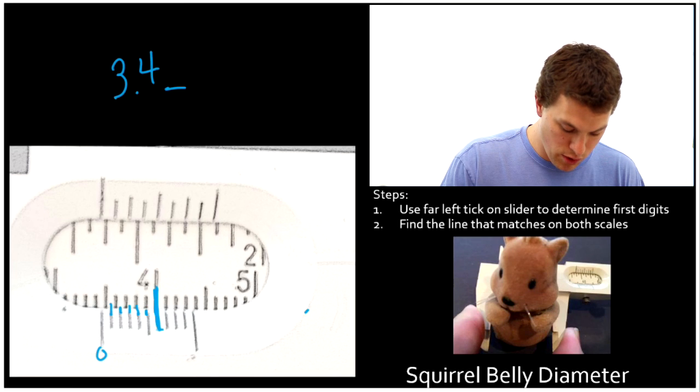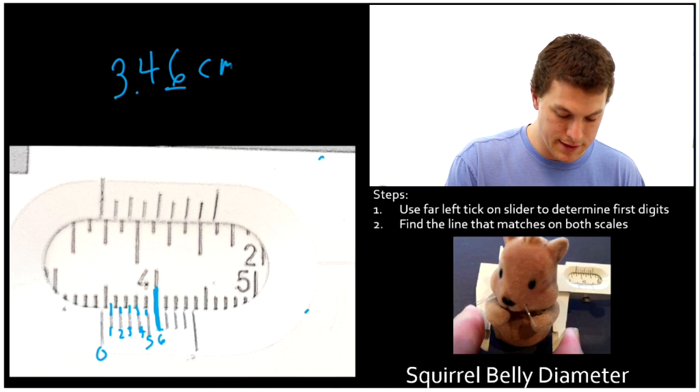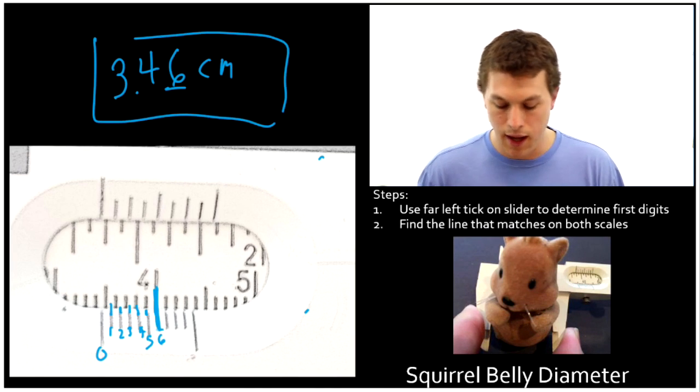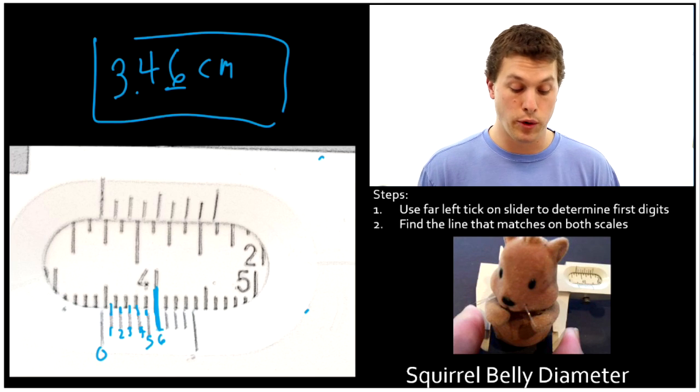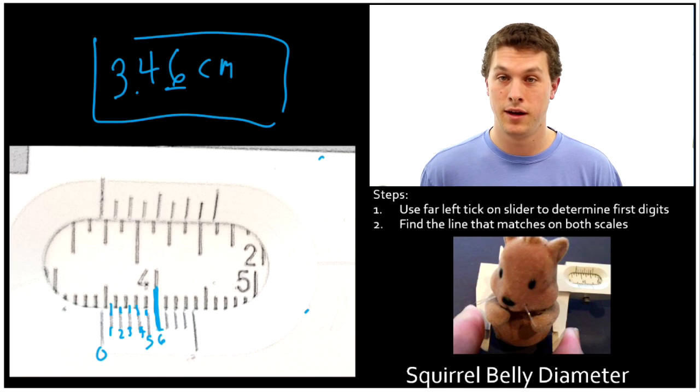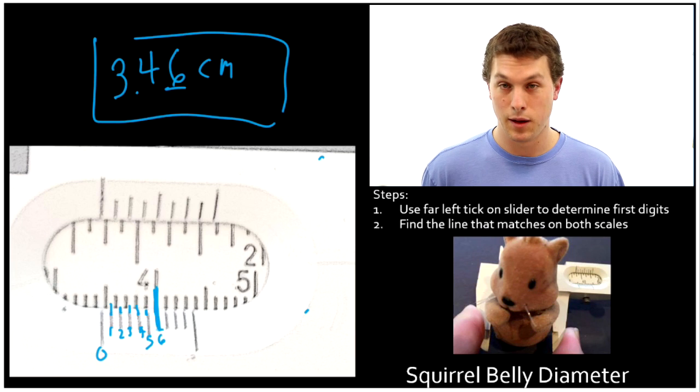And then again, we've got to count. Zero, one, two, three, four, five, six. So that means this digit should be six. And I'm going to add centimeters. So my squirrel belly's diameter is 3.46 centimeters. Seems like he's been eating too many nuts. He's got to cut back on those.